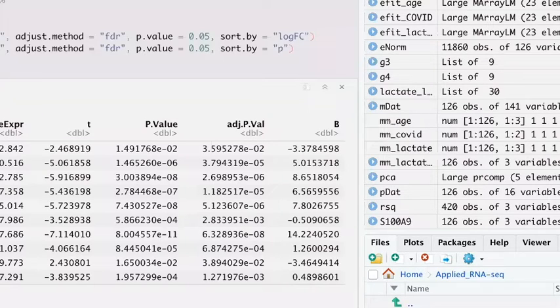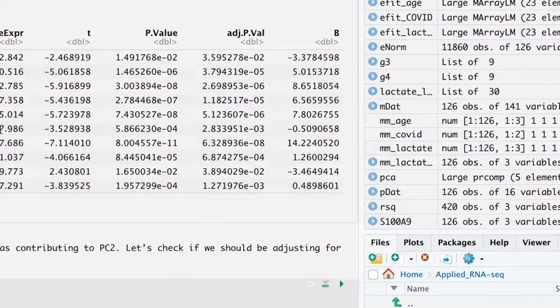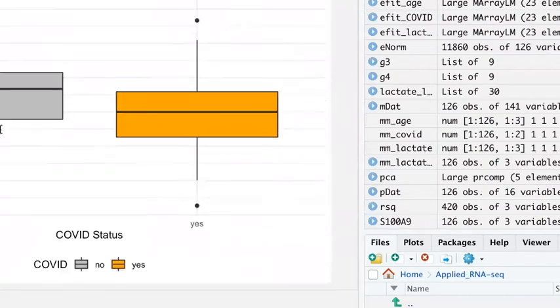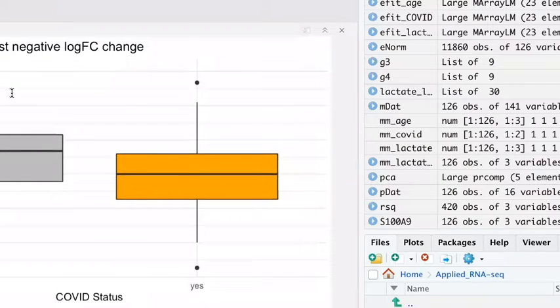Yeah. But if you look at the actual data, the fold change is not that different. The actual plots, right? Yeah, I know. So I think there's an error in the labeling of that log fold change. I don't know where it happened, but if I was to look at the log fold change here, I would say maybe a 1.1 fold change, 1.2 fold change. So as a log, it's going to come off as even smaller, but not minus 10,000. So I don't know what happened.